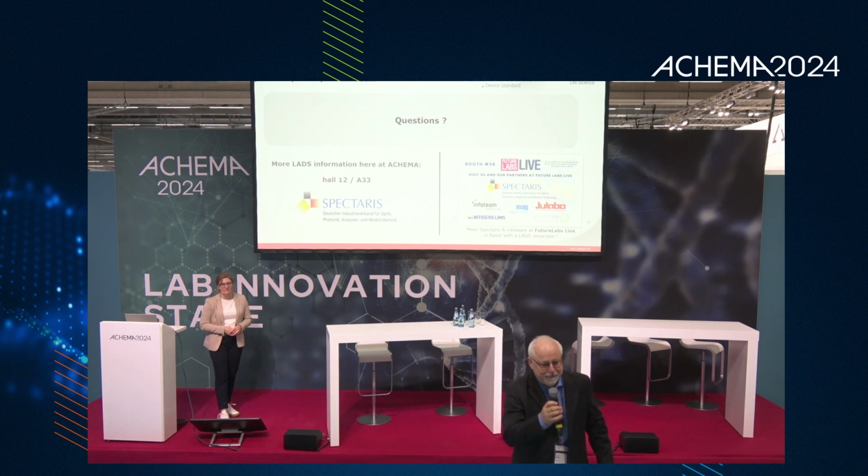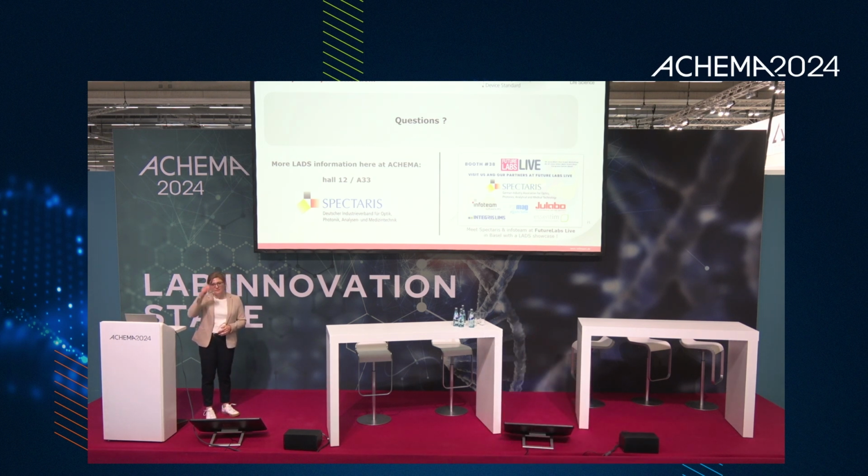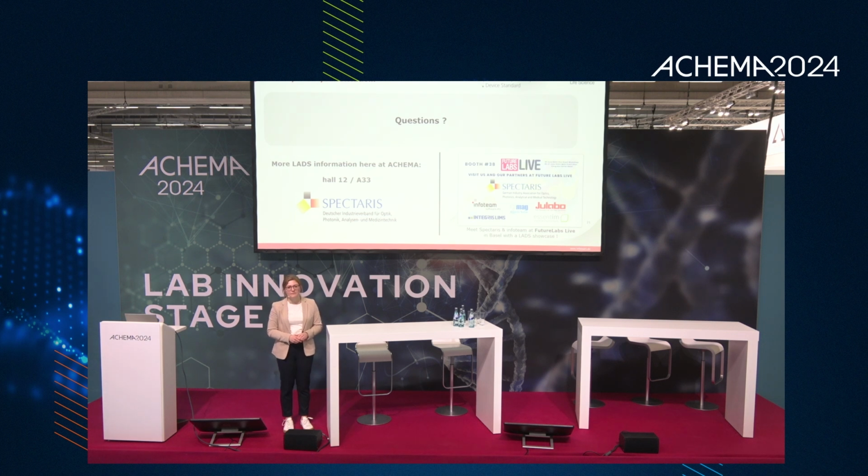One question. Thank you very much. If I hear from what you presented, it means that for any lab to buy into this, you probably have to change all the equipment in your laboratory. Is there no way to do something about some of the equipment you currently have to be able to get compatibility with this particular process?